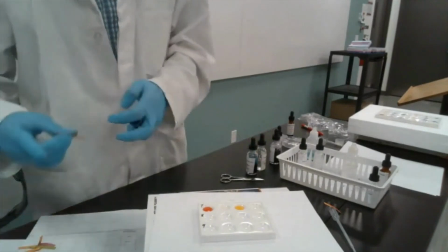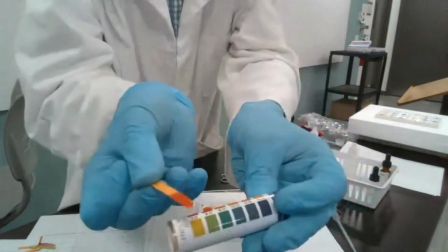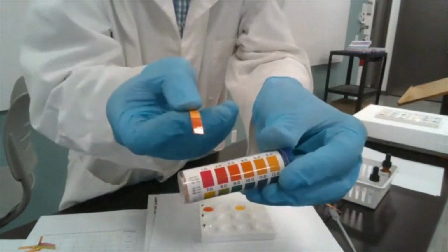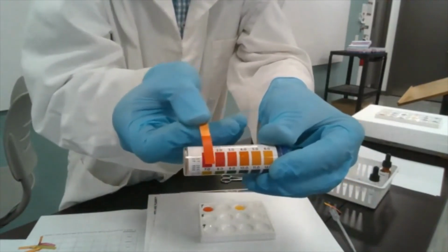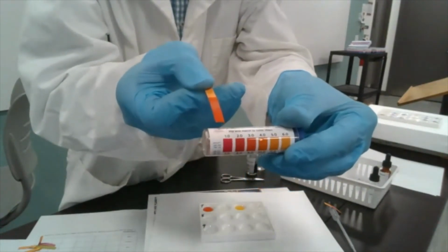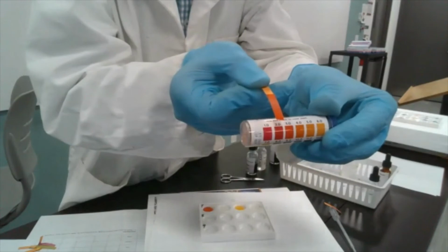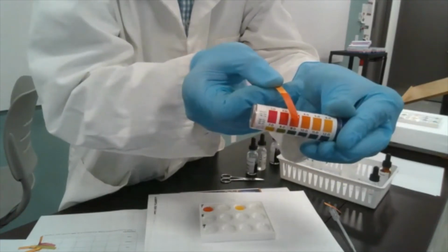Let's dip another one of these pH strips. Okay, so there's definitely color change from what it was before we dipped it into the solution, but let's see what it is. I'm just going to try to rotate. No, you're reading the wrong set of numbers there. Just read the top. Yeah, so I would say this is probably between 3 and 4, maybe, depending how you look at it.